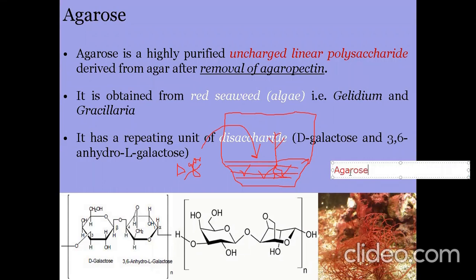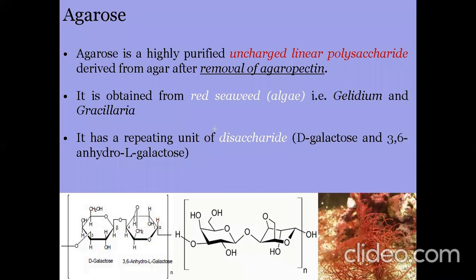And agarose is what we use in molecular biology, where we make gels from agarose. The property of the gel is that it provides molecular sieves, so we can run DNA, RNA or proteins and do electrophoresis. So these are two different properties, two different things taken from the same thing. It means from the same plant we took agar, which can be used in tissue culture, and then agarose in molecular biology for the separation of macromolecules.